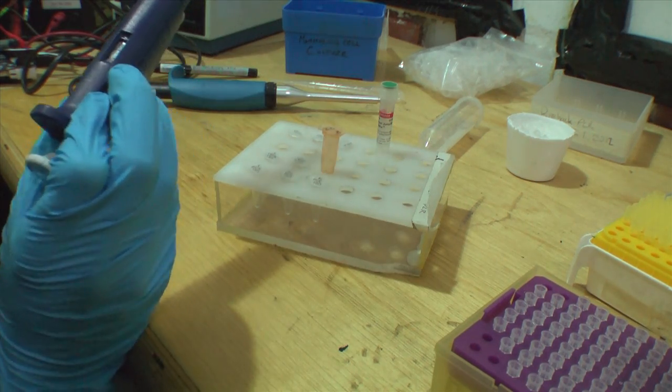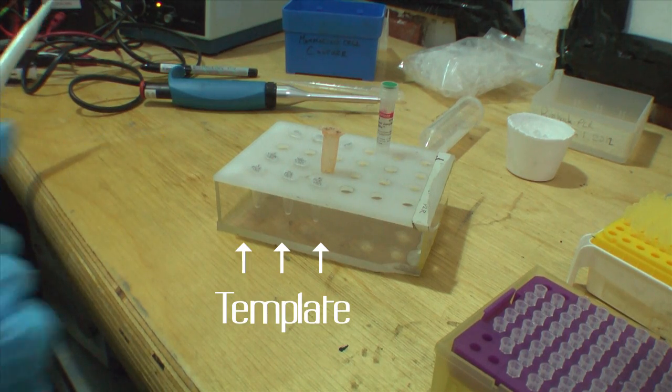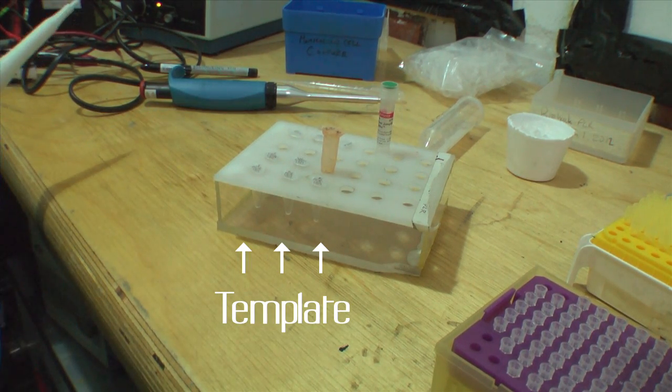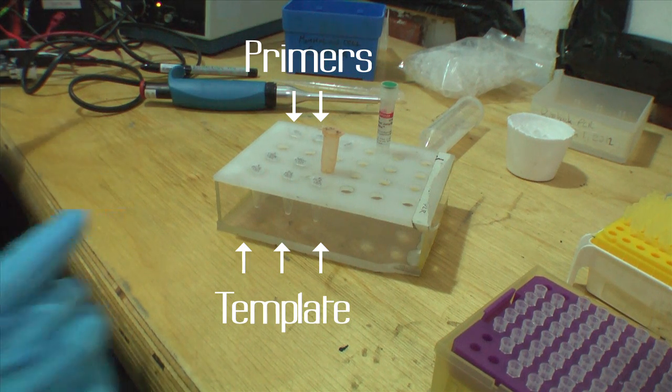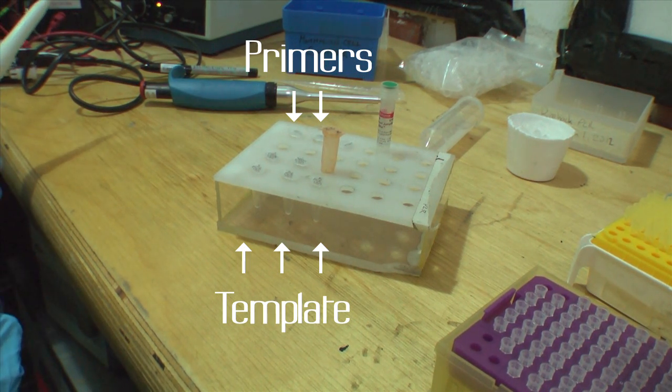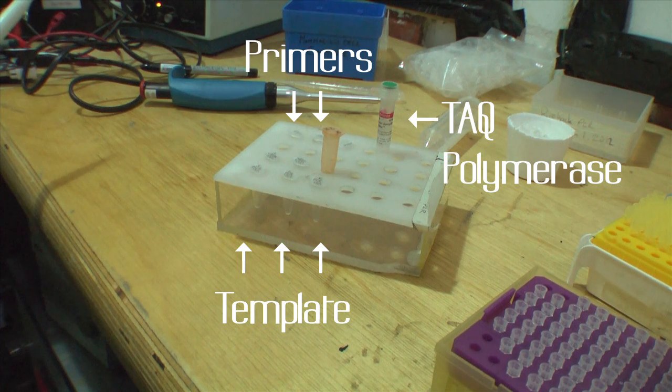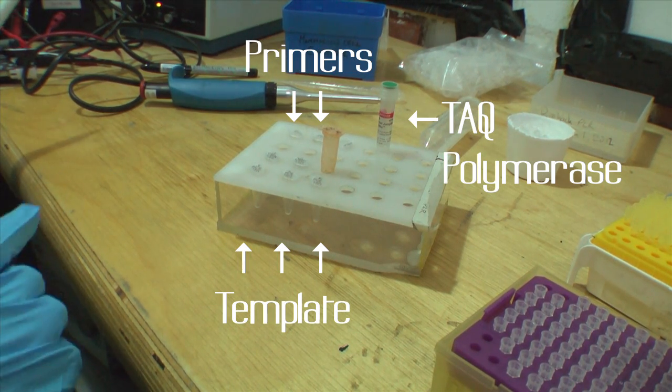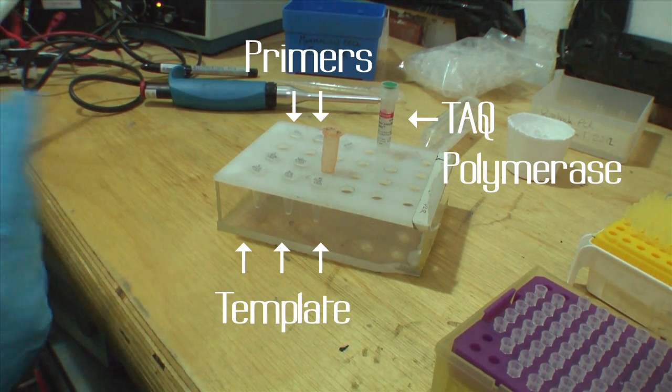PCR has got certain ingredients. You've got the template, which is the DNA we've got dissolved. Then you've got primers, which are what actually isolates each end of the DNA sequence you want to get. You've got Taq polymerase, which actually amplifies the bit you want to get, so we get lots of it. And then there's just water for dilution.